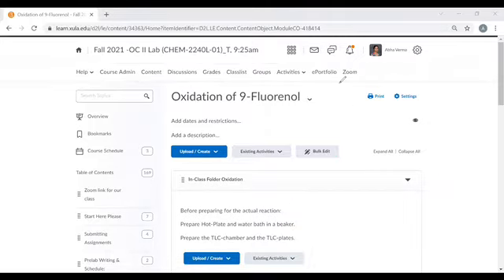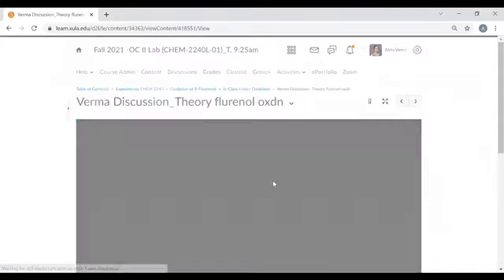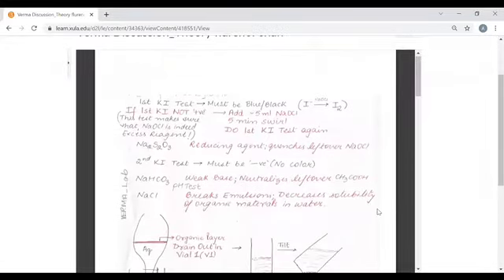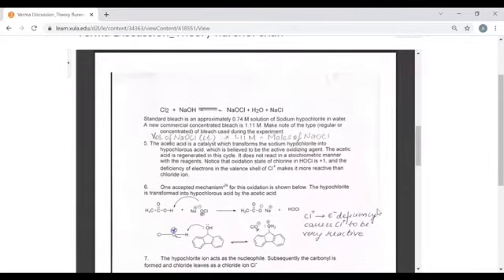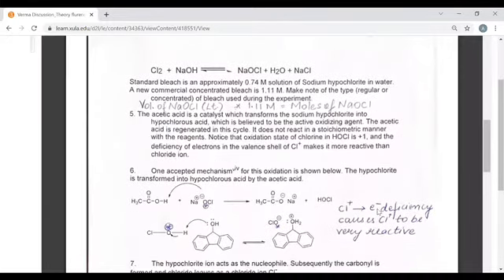Broadly speaking, what is oxidation? Oxidation is just gain of oxygen and loss of electrons. And in today's experiment, we will be learning about both of these steps. One of the first things that you must memorize is the role of each and every salt, starting material, and all the physical steps that we are going to do in this very experiment.